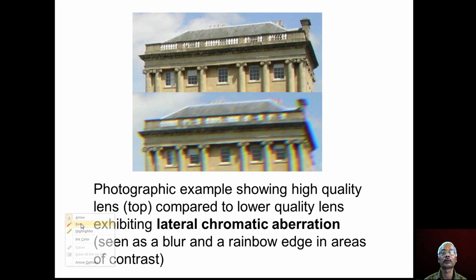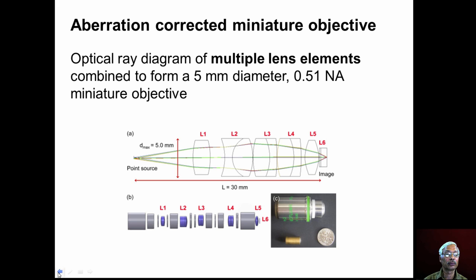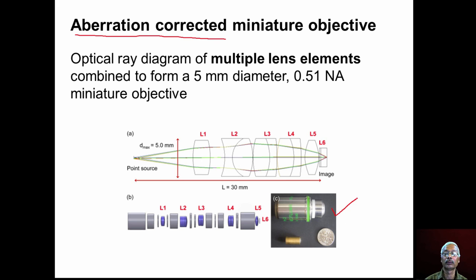Photographic examples show the difference in image quality. A high-quality lens produces a sharp, clear image. In contrast, a blurred image with a rainbow edge results if the lens quality is not proper. By using a series of lenses assembled properly, aberration errors can be corrected. For example, a miniature objective with minimum aberration has a numerical aperture of 0.51 and uses lenses of 5 mm diameter.